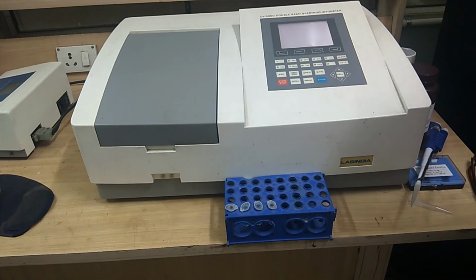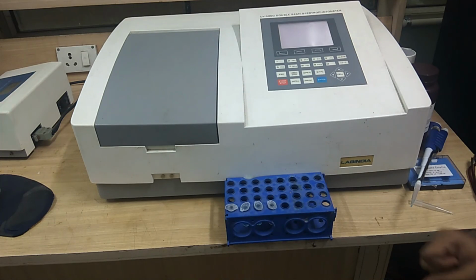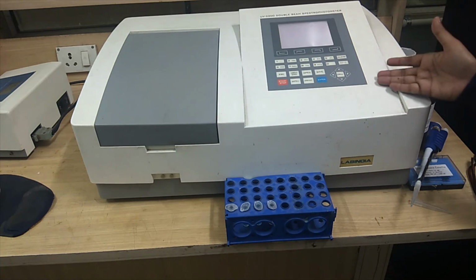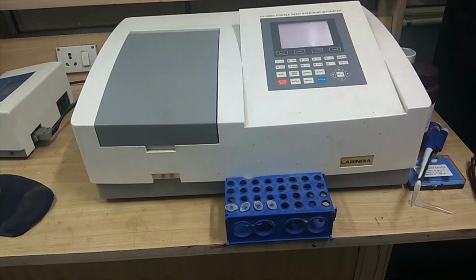This is the spectrophotometer demonstration part, and as I said, the instrument can always be handled through a desktop, so you can handle it locally, or you can connect a USB port and take the readings on the desktop also.